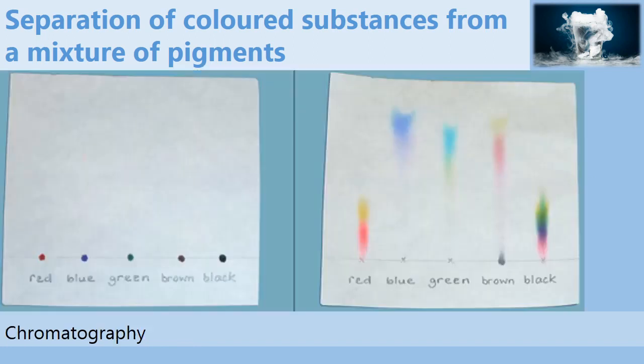An example of paper chromatography that can be carried out is shown in the picture below, where we have different colored inks. At the beginning of the experiment is the start before the experiment, and at the end of the experiment the chromatogram was removed from the solvent and the results were obtained as follows.